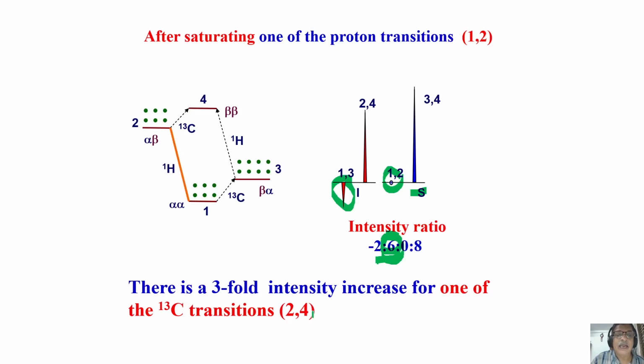What I will do is, I will stop now, come back and continue with the heteronuclear selective population inversion, then go to the INEPT sequence and then DEPT, so that all these editing techniques will be understood. Because INEPT and everything is very useful in all the 2D experiments like HSQC and others. Whenever you want to do polarization transfer, these modules are used. So we'll come back, understand this and continue further tomorrow.